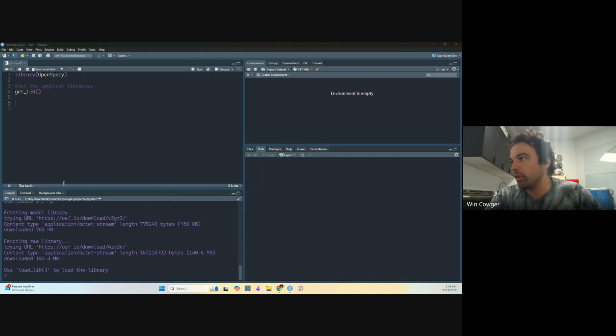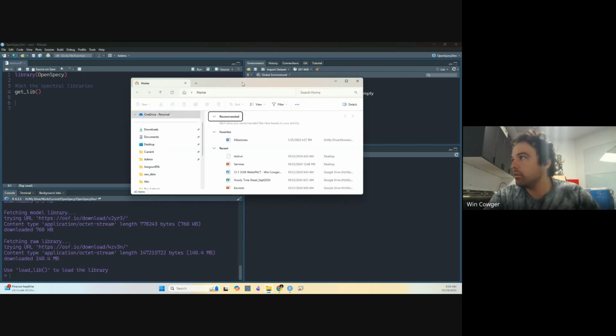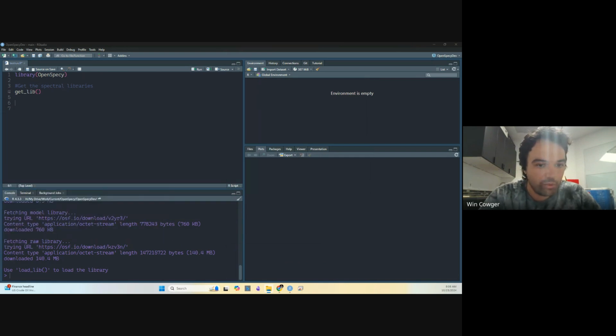The main way you probably will want to is to have your own file that you want to grab. Let me see if I can find a good one here.